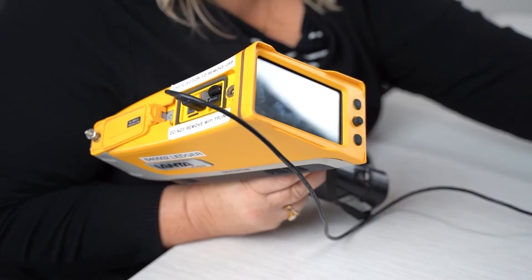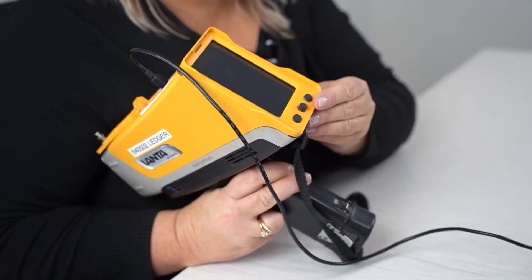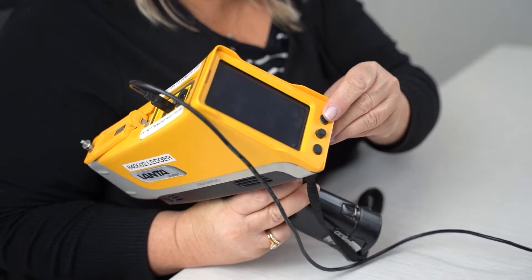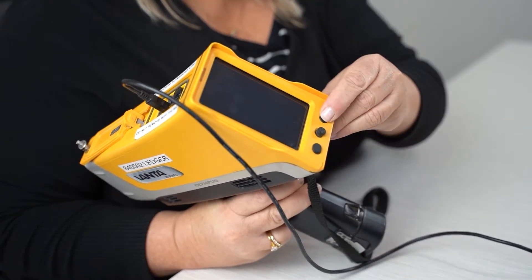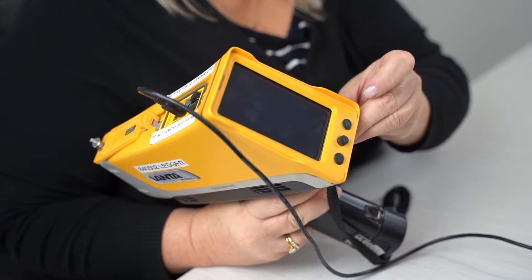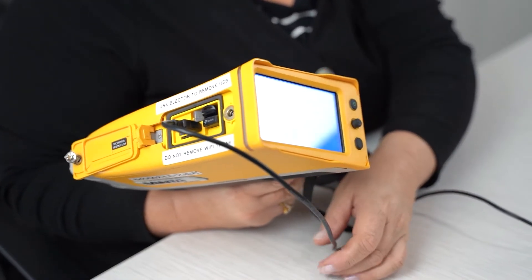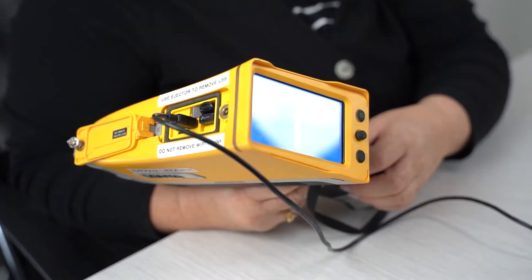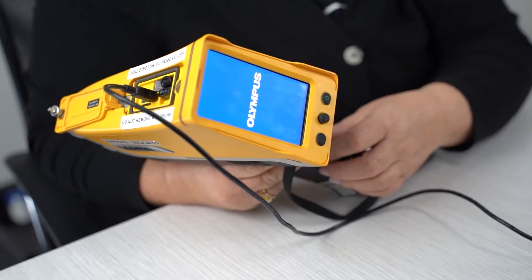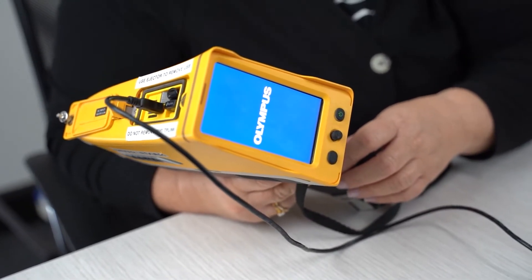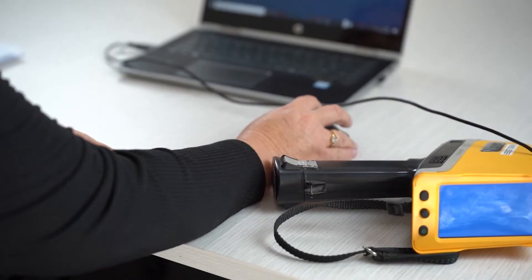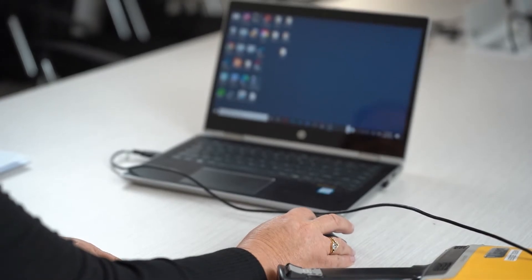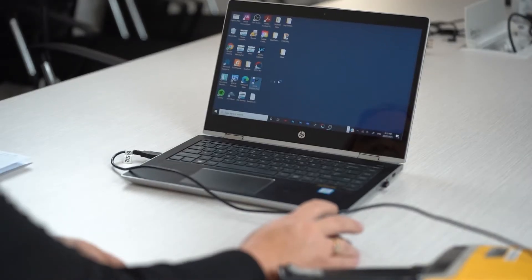So once you plug into the PC, you're going to switch on the instrument and wait for it to load. And then you're going to open the Vanta application software on your PC to connect it.